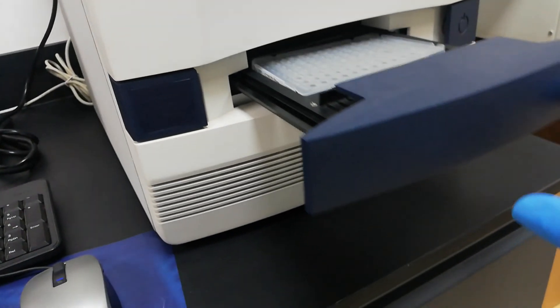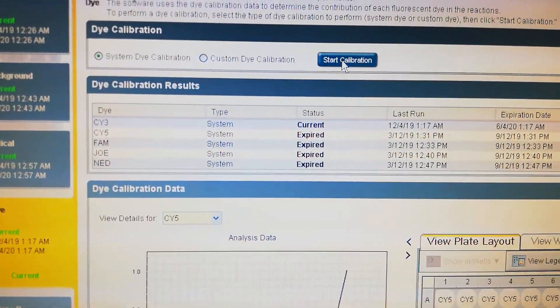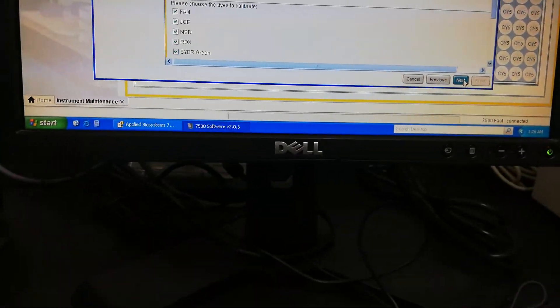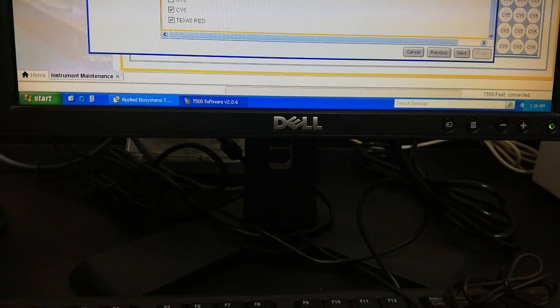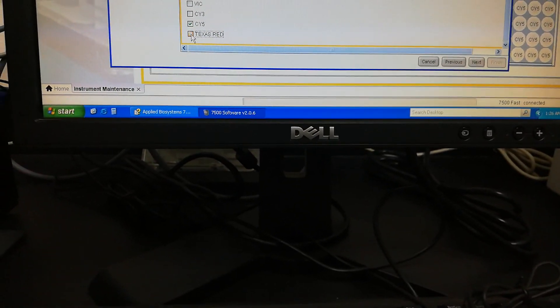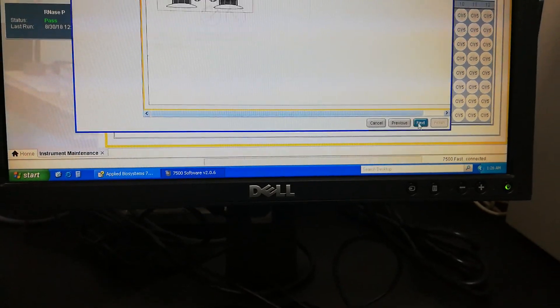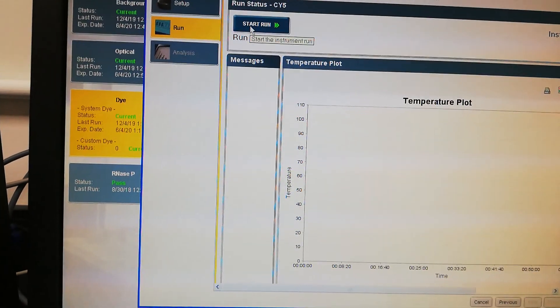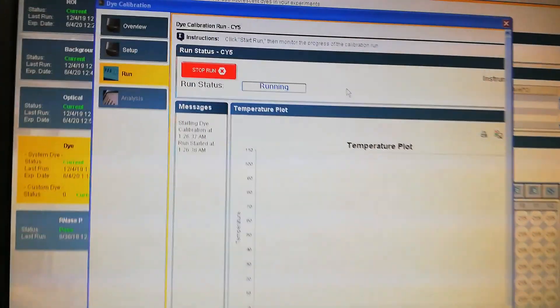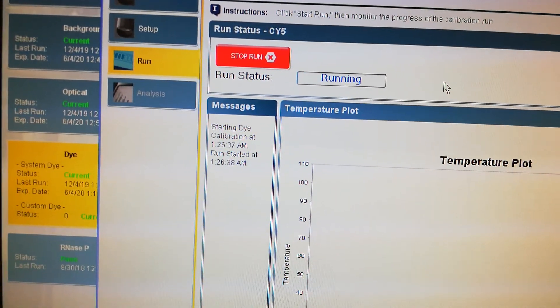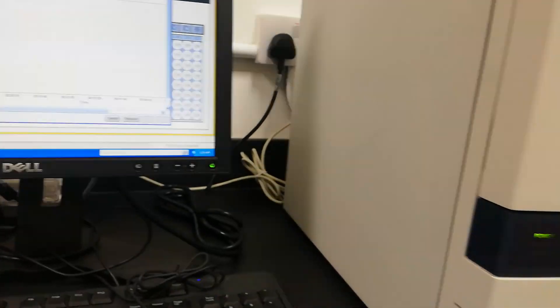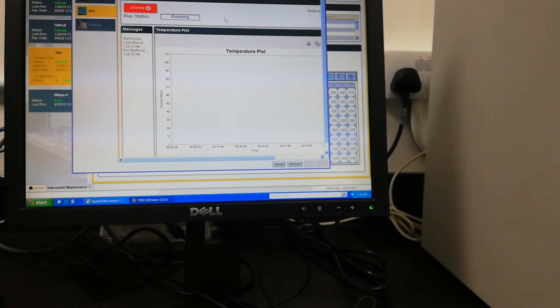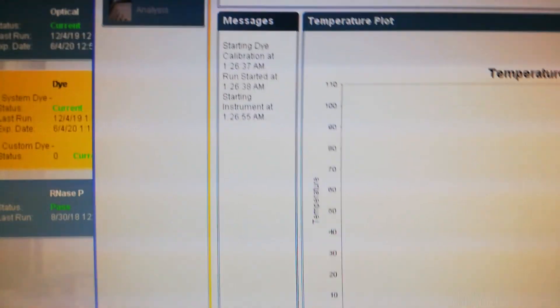Here, start calibration. Next. Start run. Now it is running. The system will start, now the system has started.